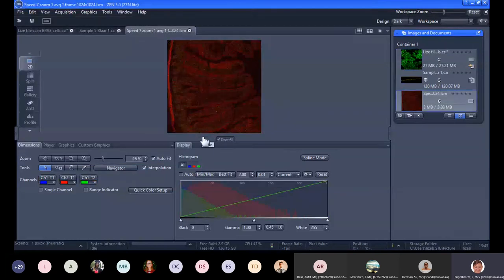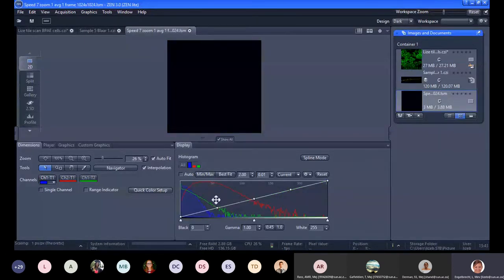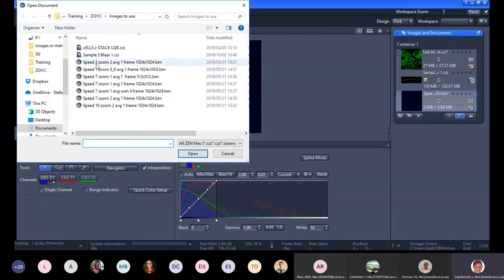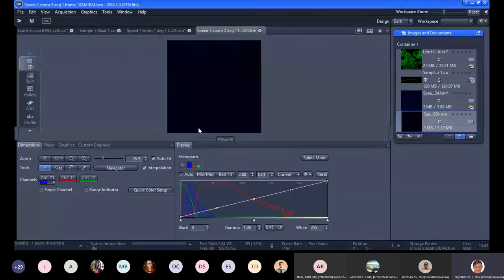Okay, so this is mouse intestine. It's not a very good sample. That's actually specifically why I'm showing it. I want to focus on the blue. The blue here, which you won't see very well, is from goblet cells. So the goblet cells are very, very dim. There's one there. I might not have taken the best example. Let me just quickly see if I get a better example in the list. That might be better. Yeah, I can already see the blue shows up. So you can see there's blue spots. That's mucus cells in the duodenum.